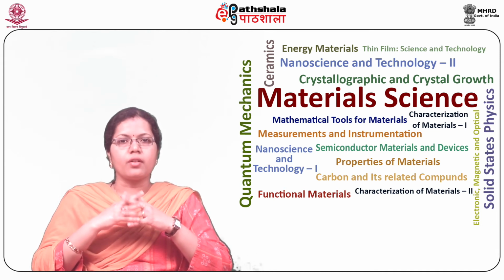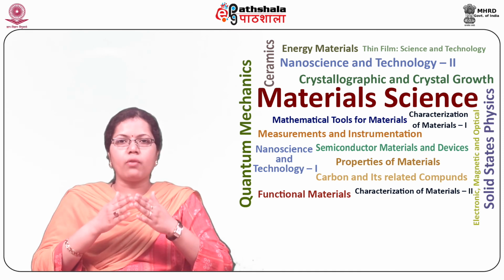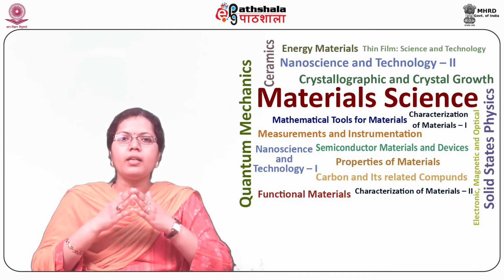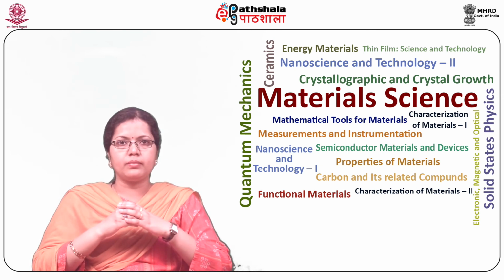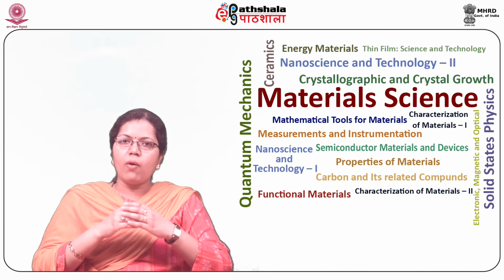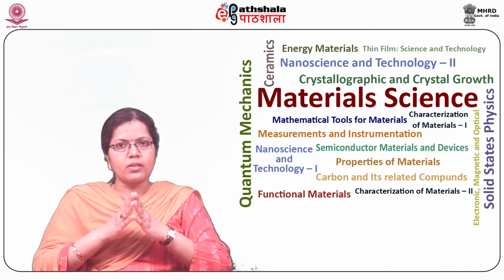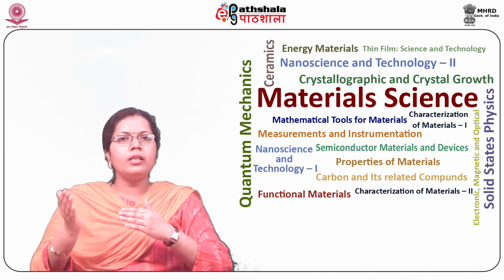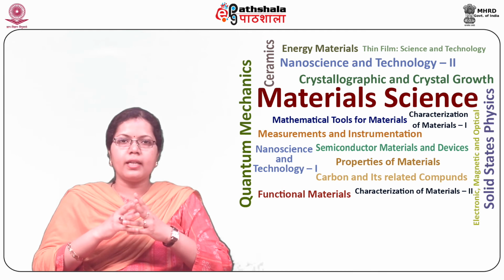Investigations involving crystallography, mineralogy, and polymer morphology can also be carried out by the phase contrast technique. Colorless microcrystals, powders, particulate solids, and crystalline polymers with a slightly different refractive index from that of the surrounding immersion liquid can be readily detected by this technique.